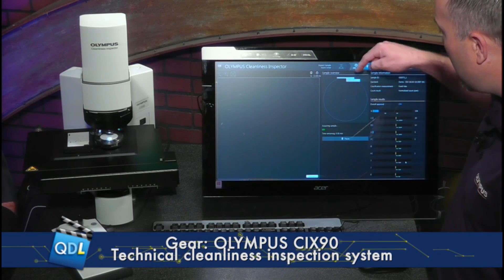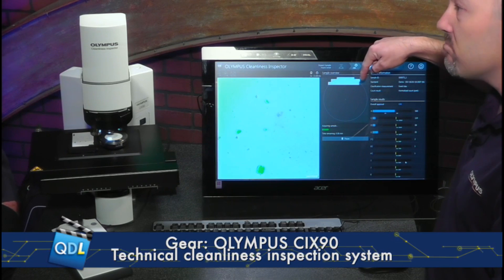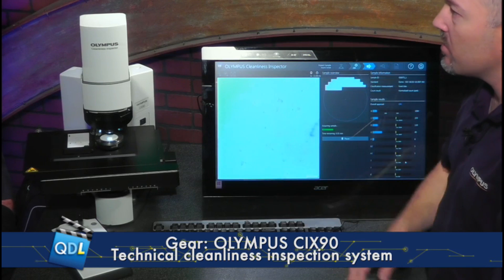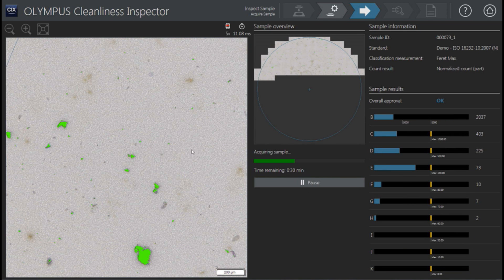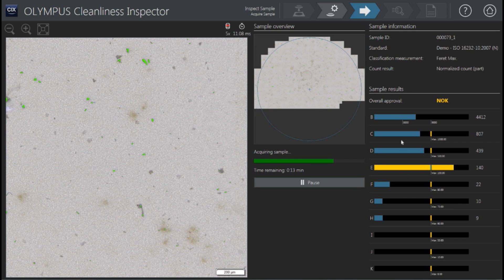So that's what we're seeing here. In the sample overview image, this shows you the progress of the scan as it goes through. You can see the live stage scanning on the system as well. Switching to the software view, you're going to see live images flashing by just to show that it's detecting particles — if something was wrong, you'd see it right away. On the right-hand side, you're seeing your approvals. In our standard, we said particles need to be separated into bins: 5 to 15 microns, 15 to 25 microns. It's counting them as it goes along.